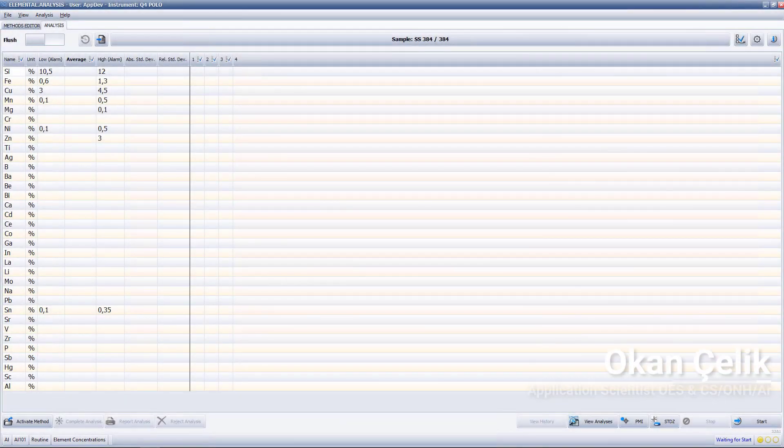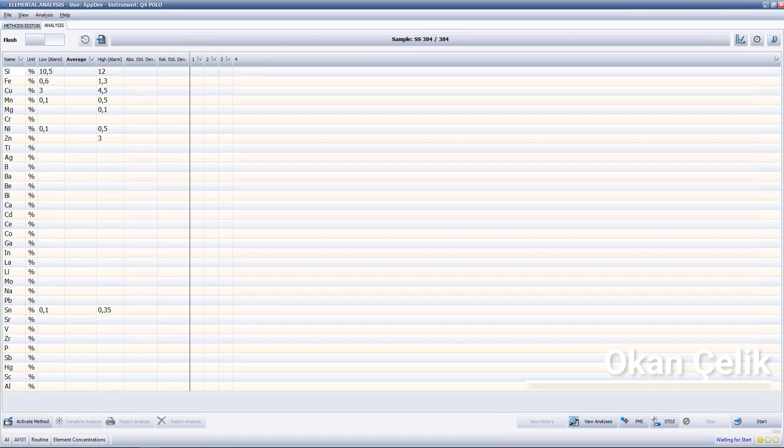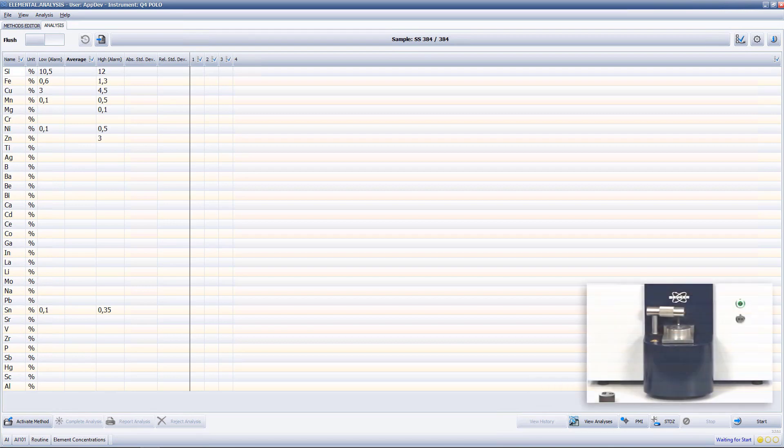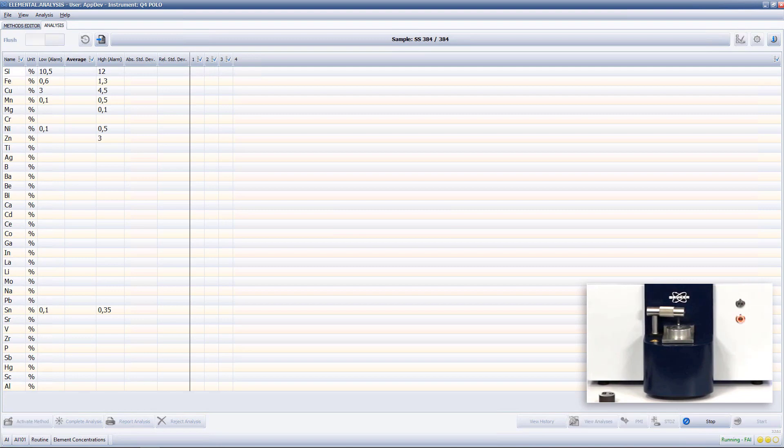Hello, my name is Okan Celik and this video will demonstrate an aluminum alloy analysis on the Q4 Polo. As always, I start the analysis by pressing the start button on the Q4 Polo.